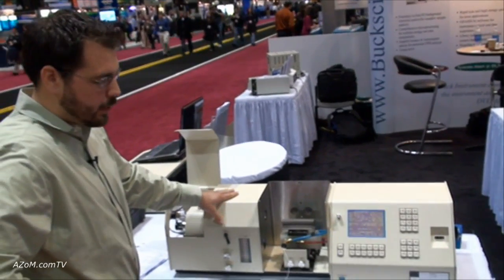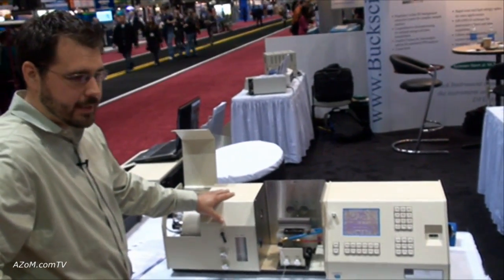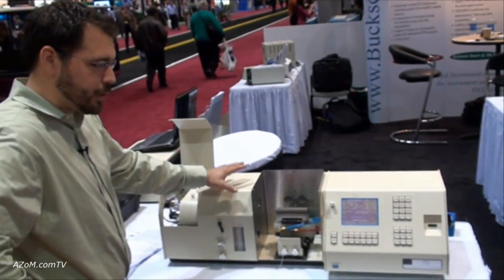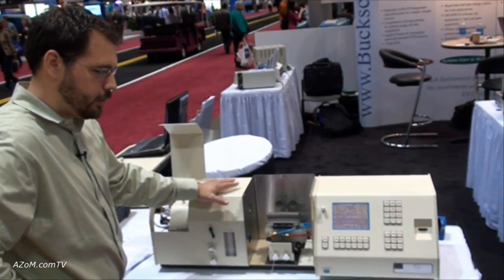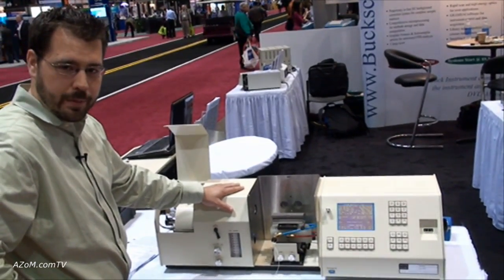It's all metal, all made in the United States. We've had people that have had these instruments for 20 years and are still using them. They're small enough that we can do repairs back at our facility in East Norwalk, Connecticut, which reduces repair costs significantly down the road if anything needs to be replaced.